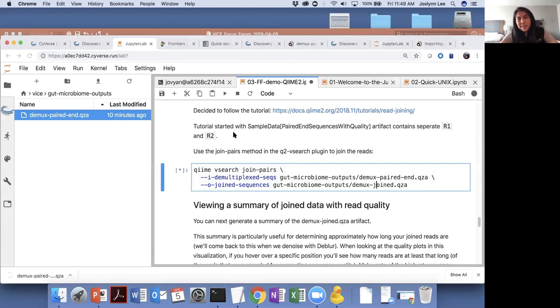Okay, I'll answer the one about DADA2 really quick. There are two ways to denoise and cluster your sequence data. Deblur works per sample, and it's a little bit quicker. When you run DADA2, it looks at the whole sequencing run, organizing and aligning all your sequences through all your samples. So that's going to take time depending on the number of reads in your sample sequence files and the number of samples you have. Some of mine, let's see, 50 samples that I'm analyzing, have taken probably an overnight run for DADA2, about 16 hours.